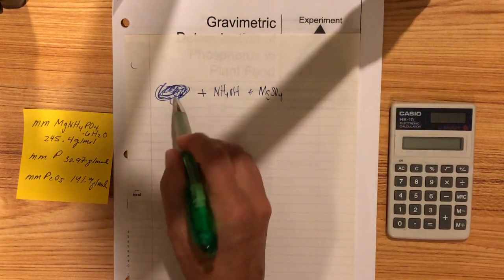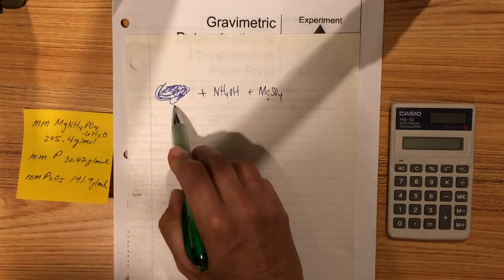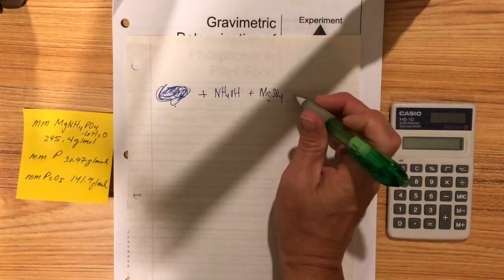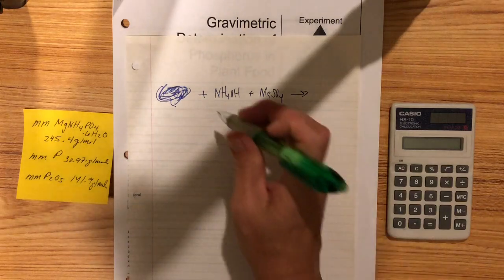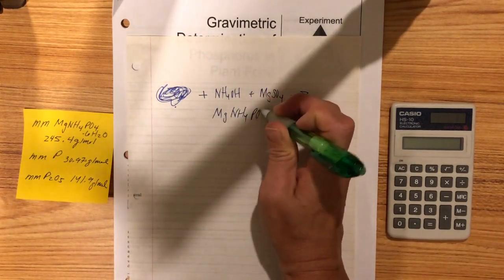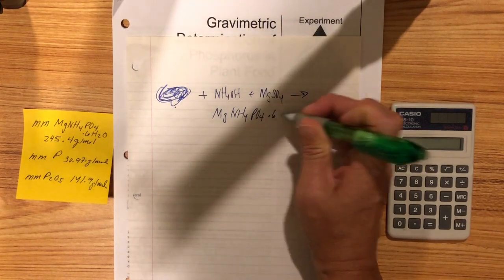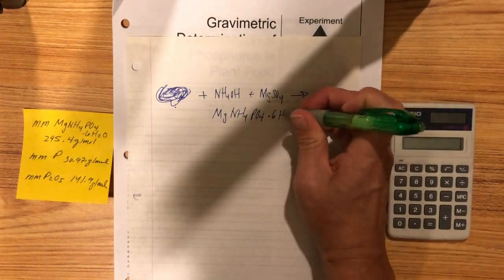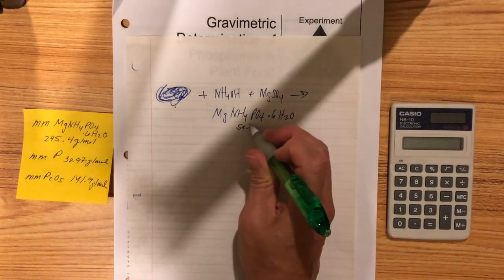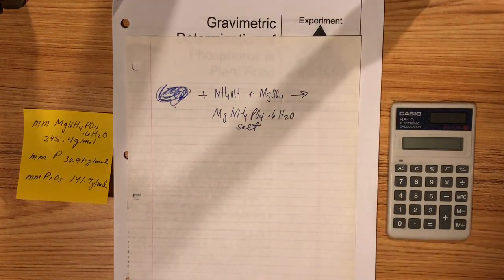Now there's a phosphorus compound in the fertilizer that when you throw it in with a base and then the magnesium, you end up forming this big gloppy solid, magnesium ammonium phosphate hexahydrate. From here on out, I'm referring to it as just the salt.